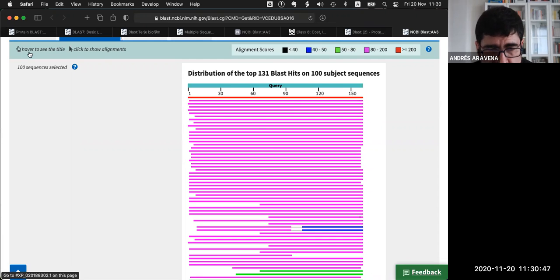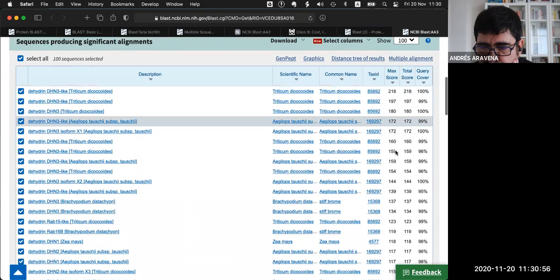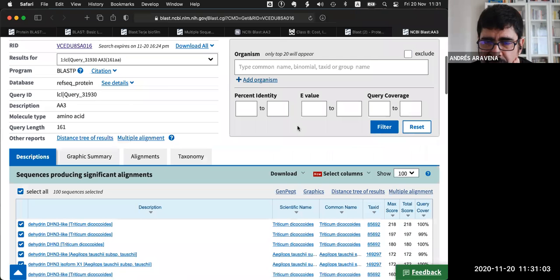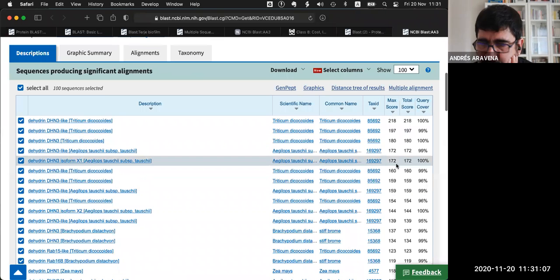Let me switch from one to another. So look, the score is 218. The rest of the scores are less than 200. And the score is going down, down, down, down. You see how the score is going down? They are sorted by score. The first is the best match, and the rest of the scores are going down. Okay?